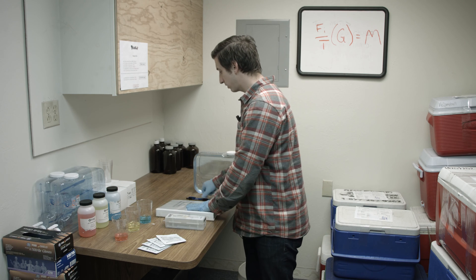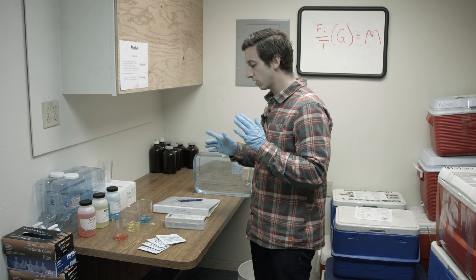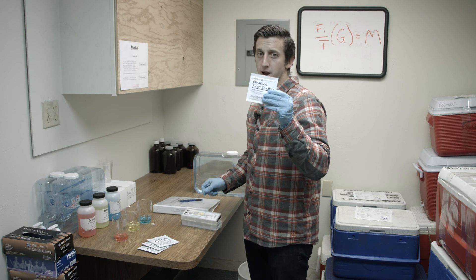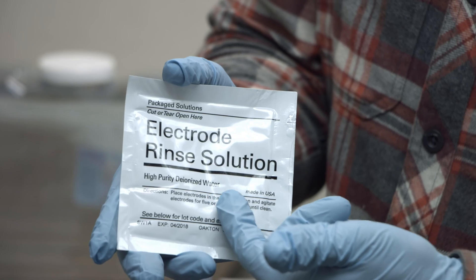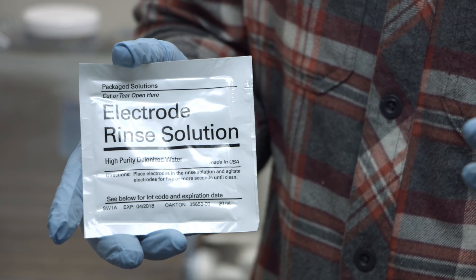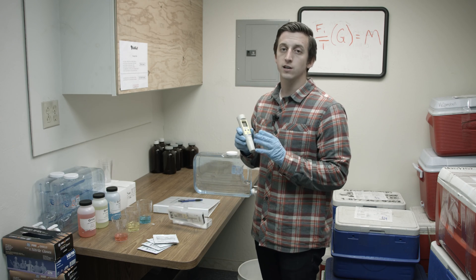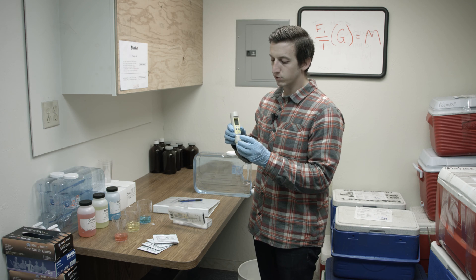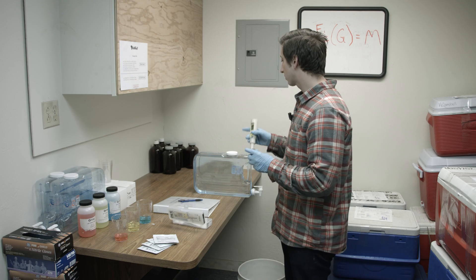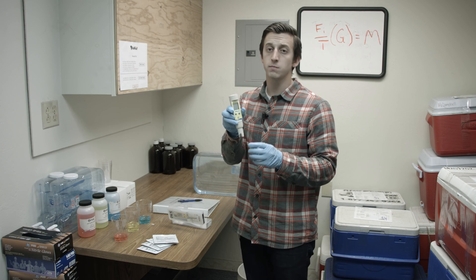Once you've calibrated, it's really important to do the proper storage and rinsing of your equipment. On these electrode rinse packets you'll notice it says high purity deionized water — it's important to know when to use it and when not to. When storing your device, never use deionized water. Simply place a few drops of water onto a piece of paper towel inside your cap with either tap water or storage solution provided by your pH pen manufacturer.